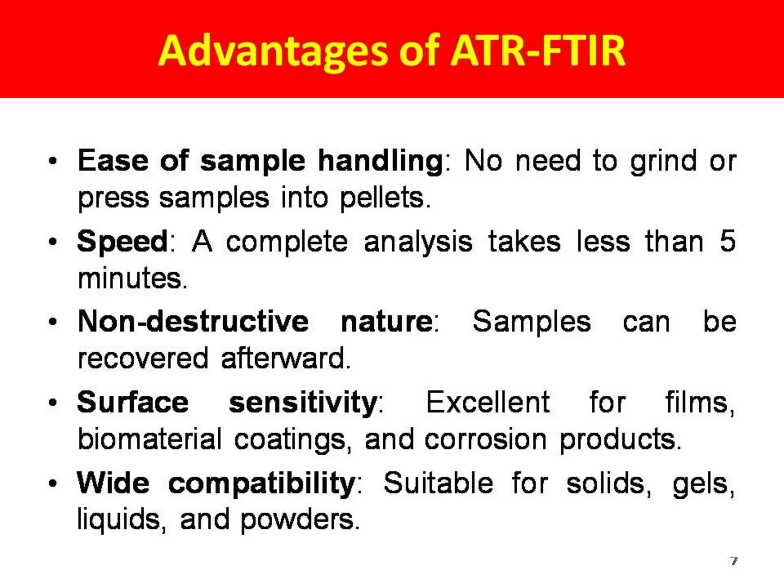Among the other instruments, the advantages of ATR FTIR are ease of sample handling; there is no need to grind or press the sample into pellets. In terms of speed, a complete analysis takes less than 5 minutes.